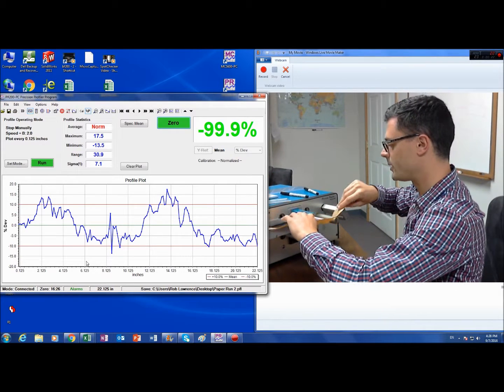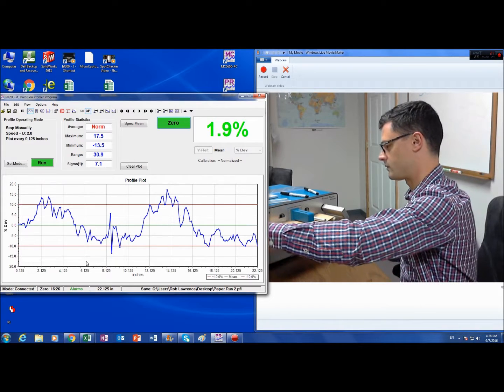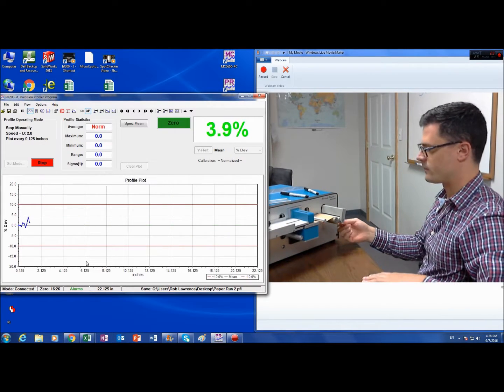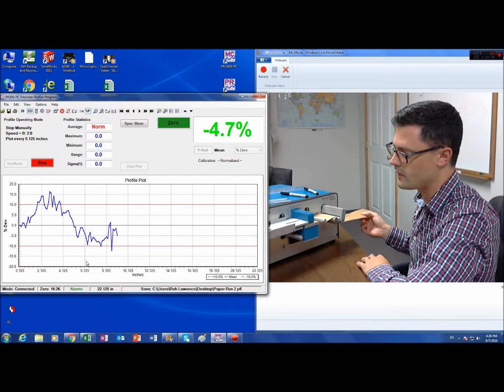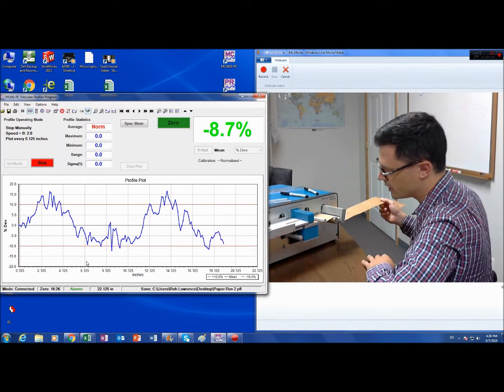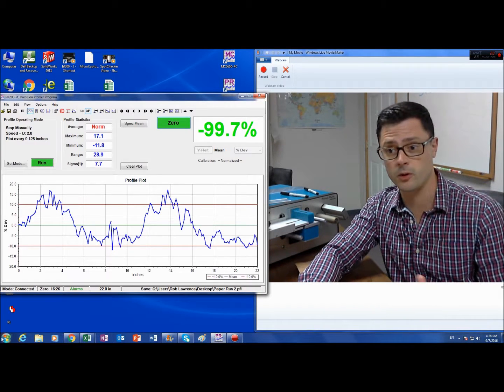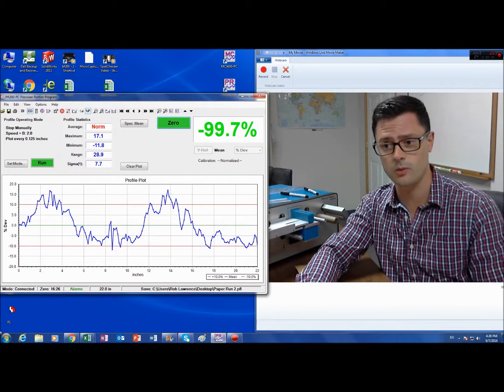You simply stick the paper in for the device, put down the foot pedal, and run. This could help you compare different paper suppliers, and it could help you with your paper production process if you're looking to achieve more uniformity. The uniformity of the paper might help you in the converting process — you might be able to get faster printing speeds, etc. So this could be important to you.